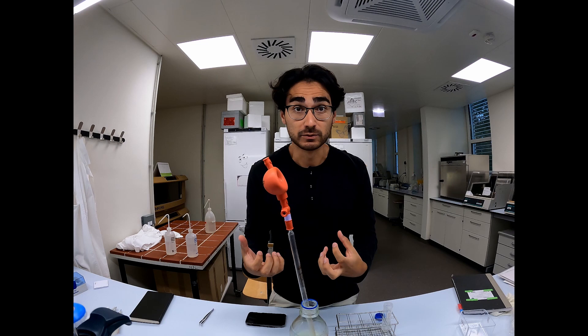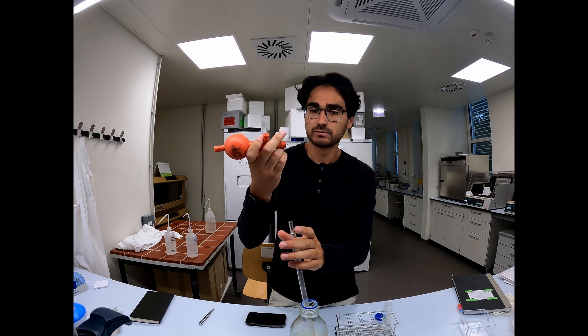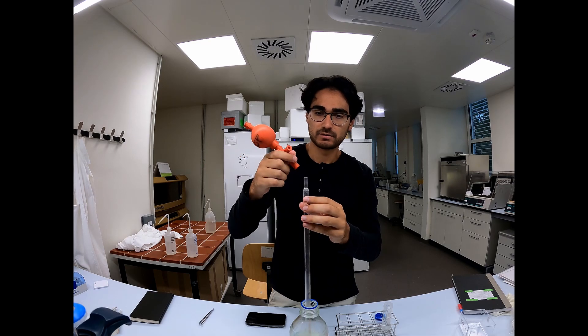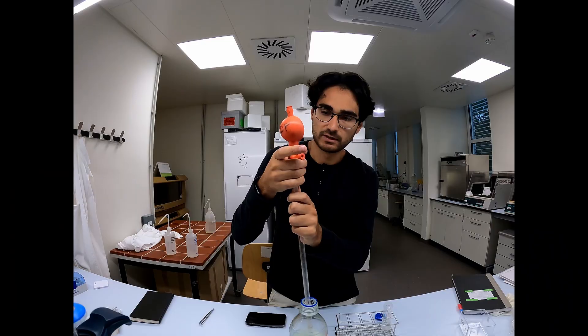So how do you use a pipetting balloon? It's actually quite simple. You take the pipetting balloon, you attach it to your glass pipet or to whatever pipet you have. Put it on so that it's very snug.